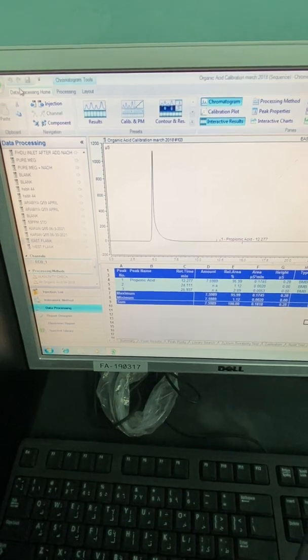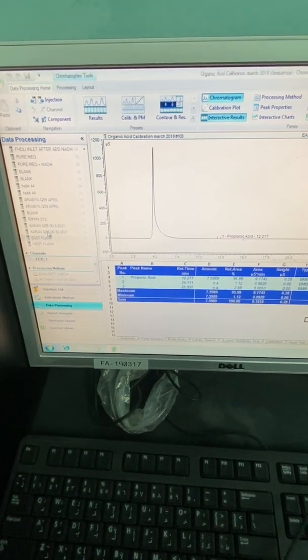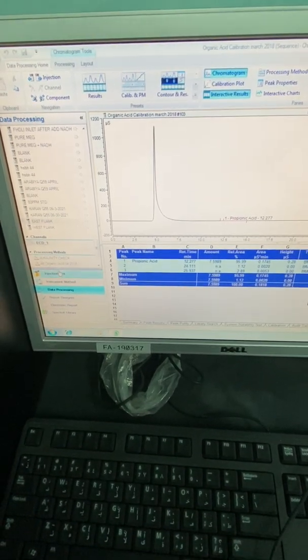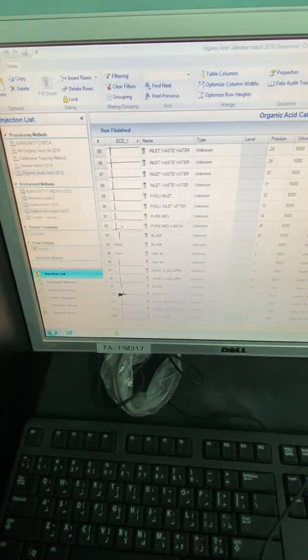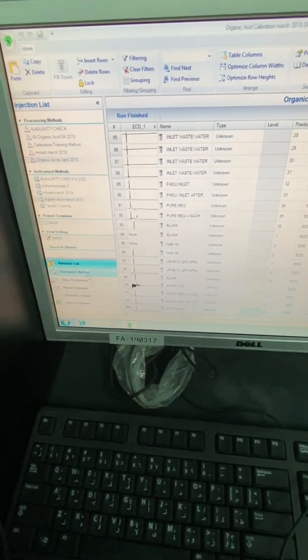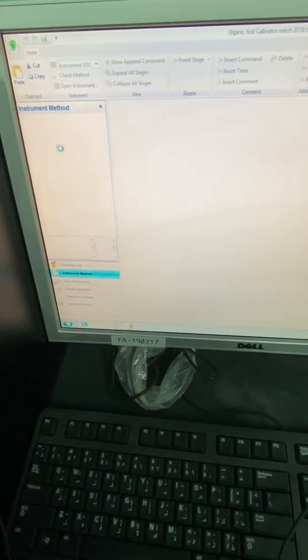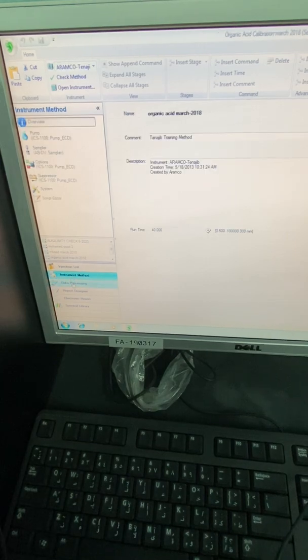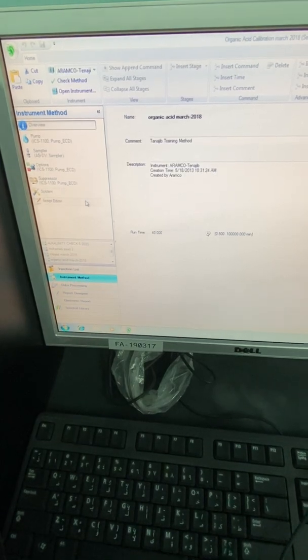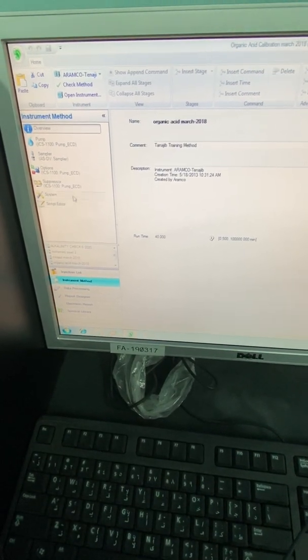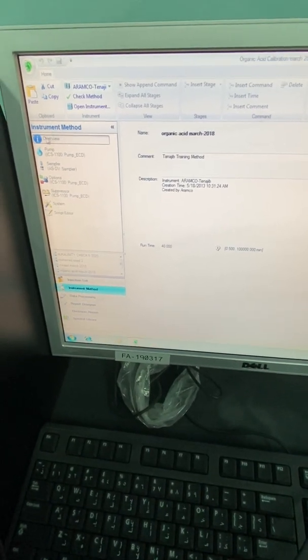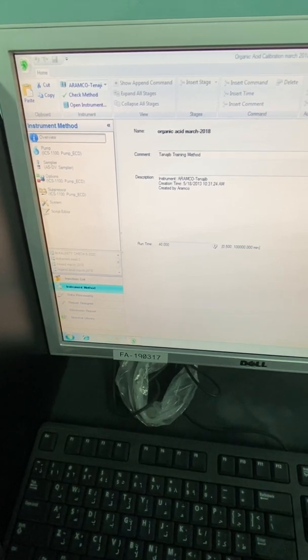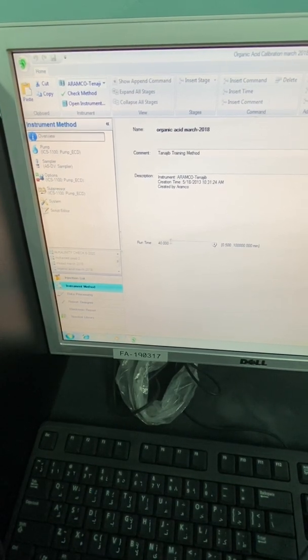From the data processing home, you will see this is the inject list that you have. This is the instrument methods, all the instrument methods that you have and the processing method. So this is the overview of the process you will have here.